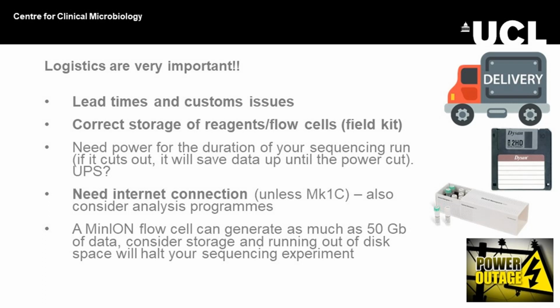So internet is also really important, but really, I think it's fine if it cuts out whilst it's running. It just really needs the internet when you first start. So yeah, internet's also important.